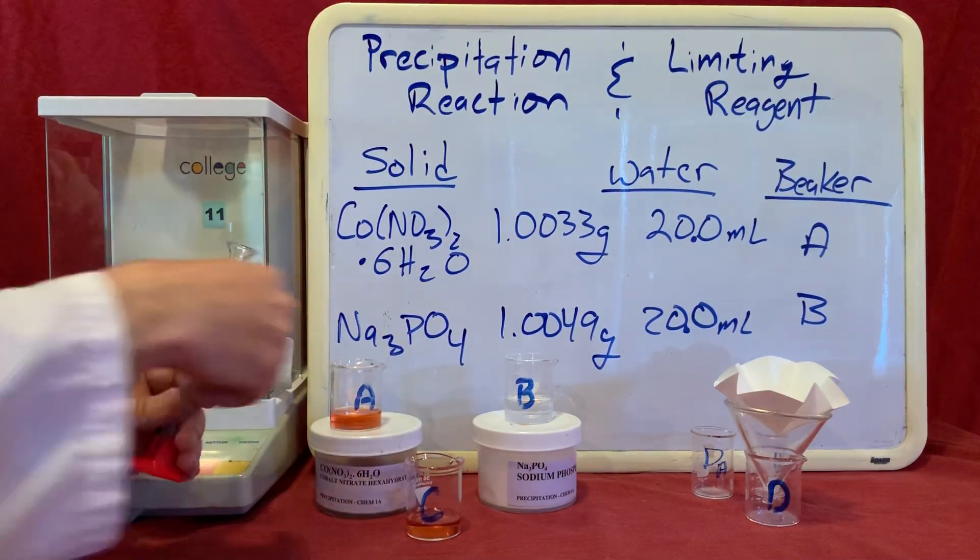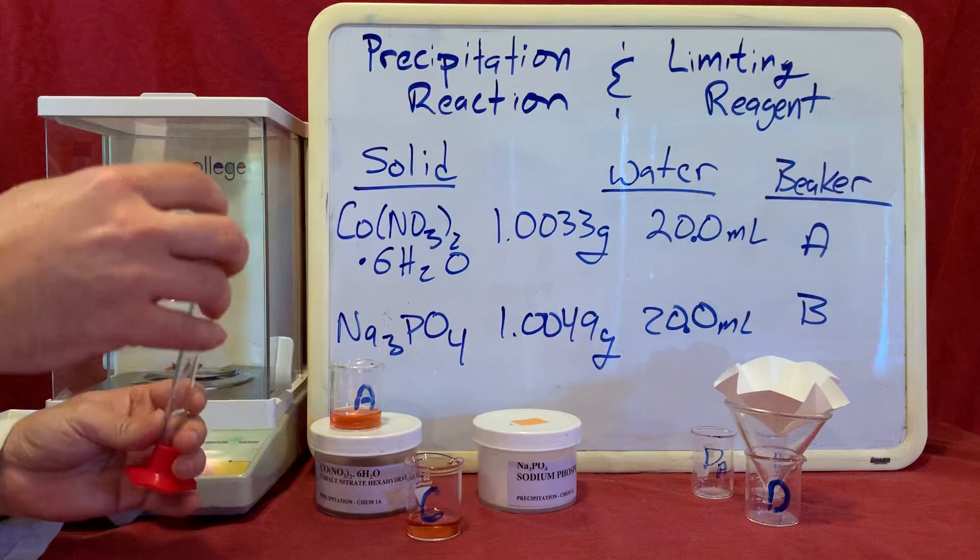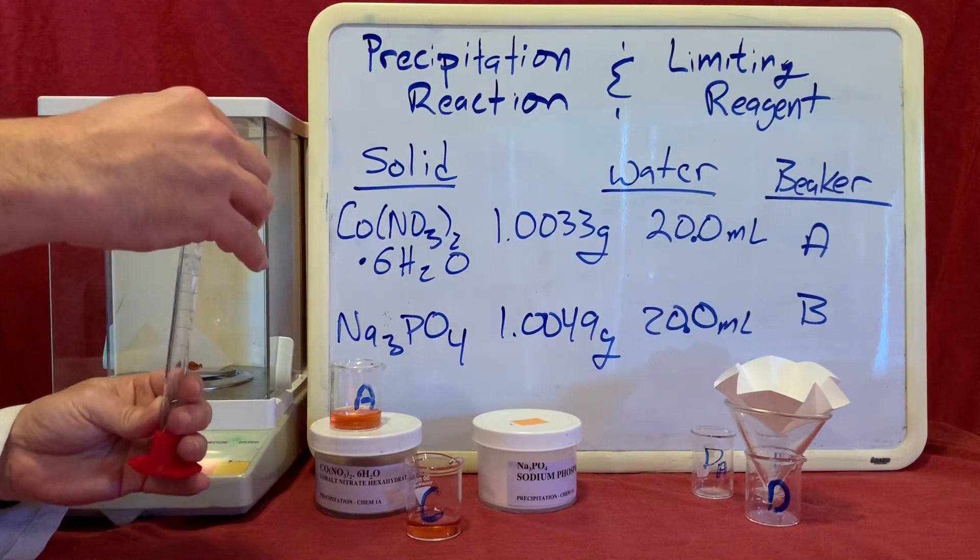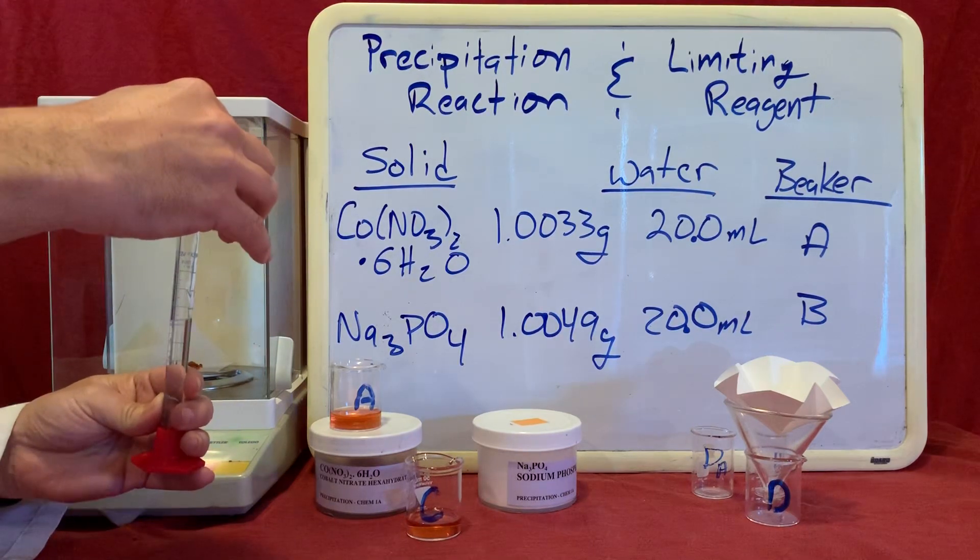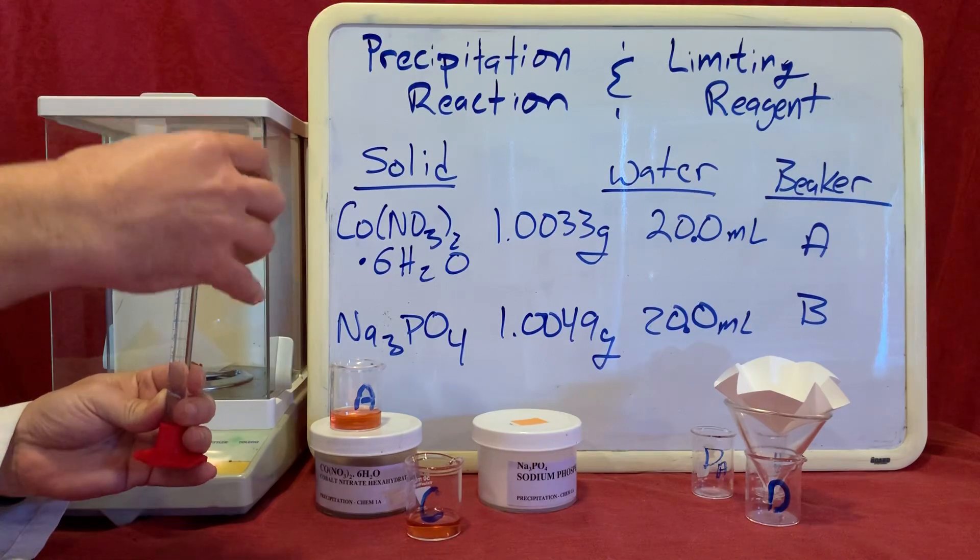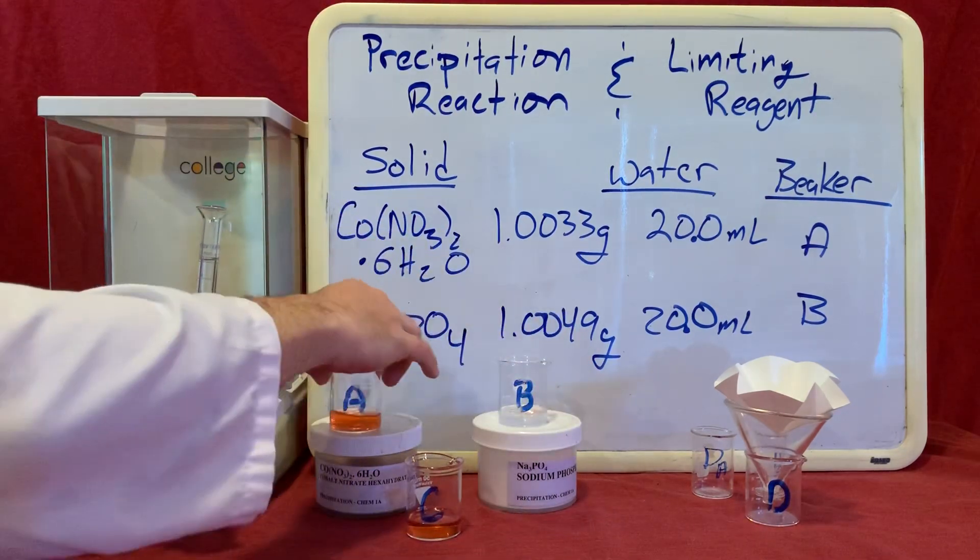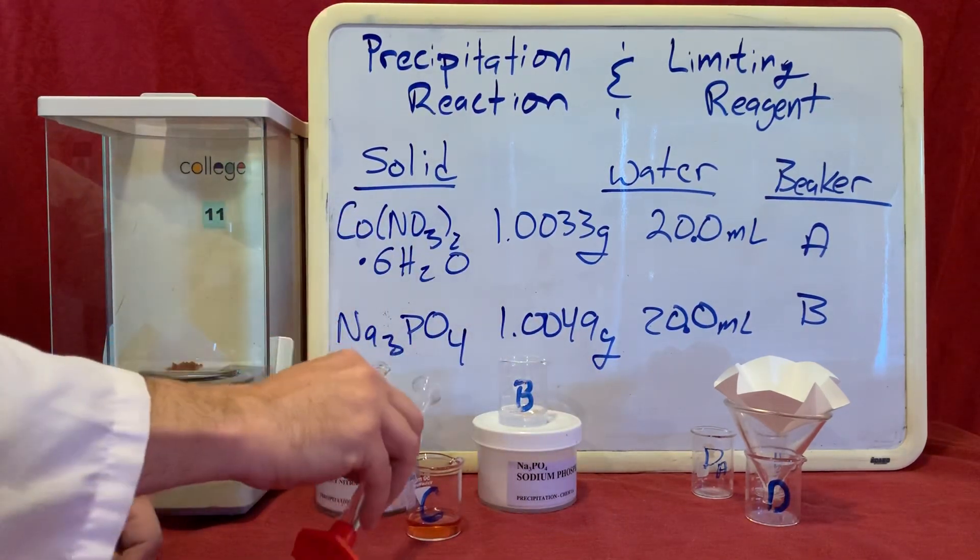I'm going to do the same. Here I've got a fresh graduated cylinder with solution B. I'll pour this into beaker C.